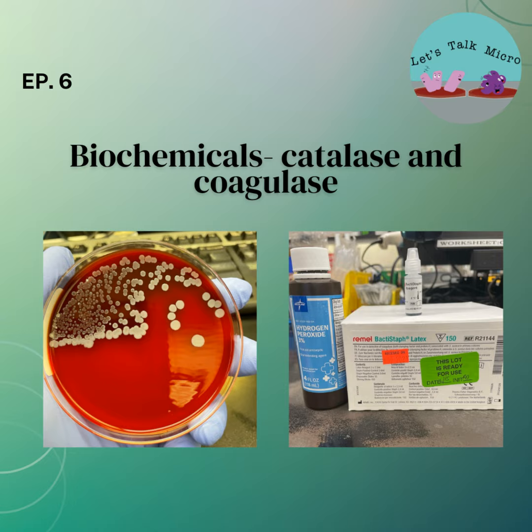So if you start thinking about that morphology, take those pictures, you're looking at them at home. At the very least, if you have that questionable reaction, you look at the organism and think, wait, I think this looks like an Enterococcus. So it should be negative. And that way you don't end up calling it staph. In an academic scenario, you lose points, right? So you might not do well on the test. But in the lab scenario, you might end up making a mistake that might cause harm to your patient.